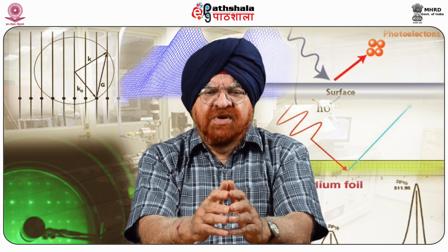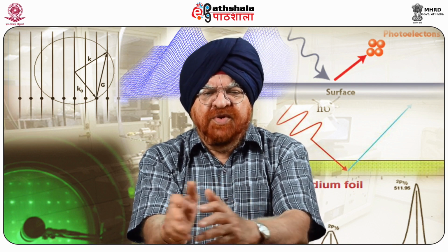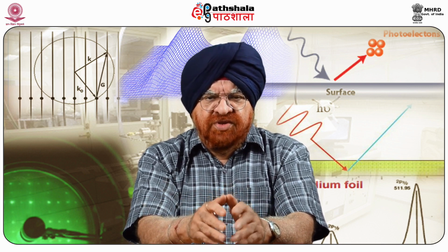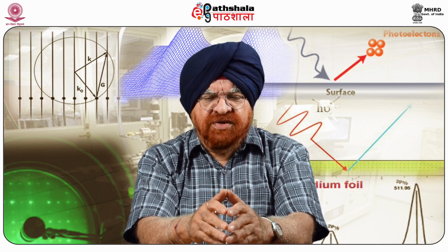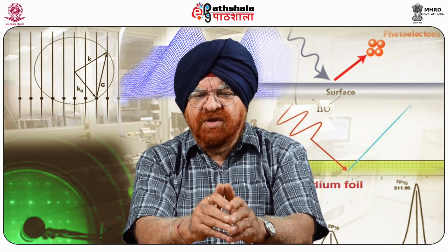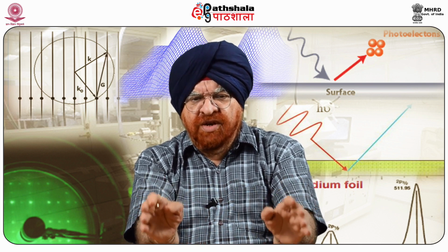CFM can be used to probe local chemical information on the surfaces of materials and biological samples under near native environments at nanoscale spatial resolution. The applications of CFM for materials characterization include measurements of single intermolecular interaction forces and investigations of nanoscale heterogeneity of surface chemical properties of polymeric materials.